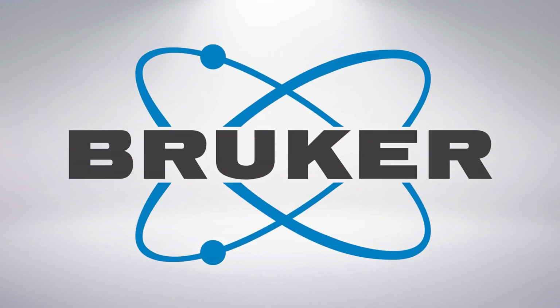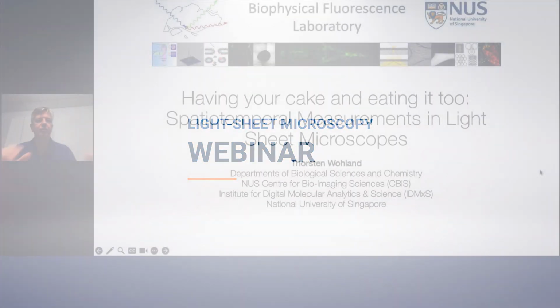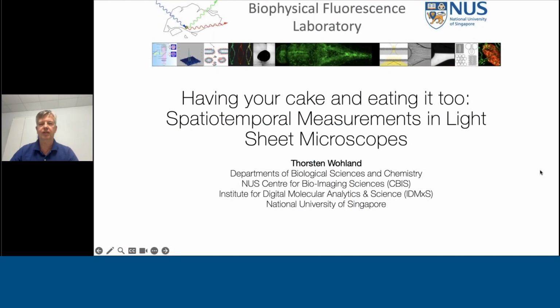Welcome to this talk. I'll try to do two different things today. The first thing is I'd like to show you that even with commercial instruments, you record data, and from that data you can extract much more information than you typically do, and that you can very often do with software you can get from the outside, on any commercial instrument. You just have to sometimes run them a little bit differently, but you'll see that.